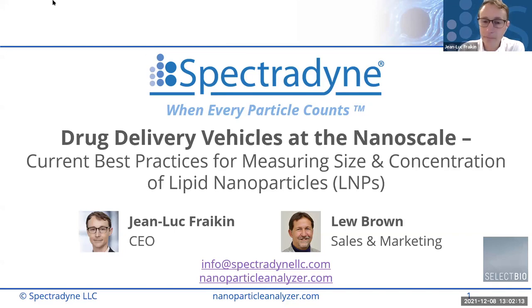So the topic of the webinar today is drug delivery vehicles at the nanoscale. We're going to talk about and share some of the insights we've seen from customer visits in the field about the current state of the art and important considerations that you want to think about when you're characterizing your own LNP samples.